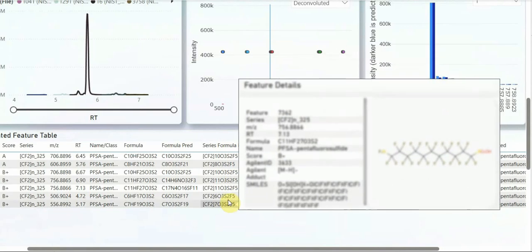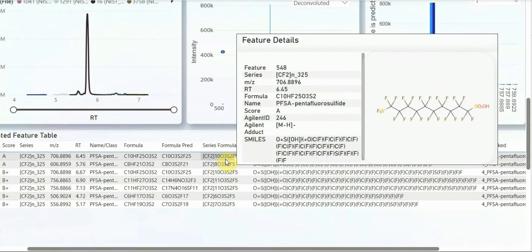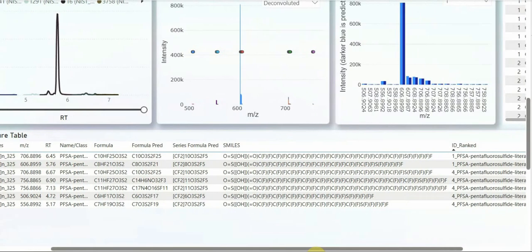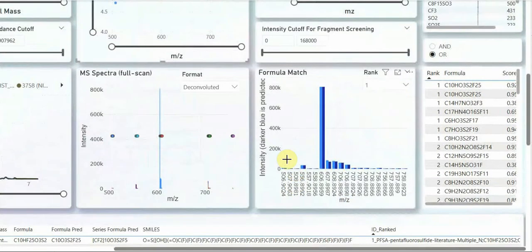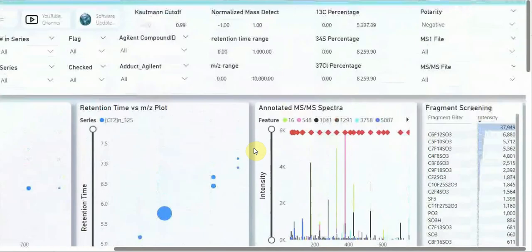And this approach is a 0% false positive formula prediction, especially when integrated with the Explorer workflow, because as you remember, the isotopic deconvolution done by Explorer across many samples that we integrate leads to much higher isotopic fidelity than if you were to use the raw Agilent files themselves in the FluoroMatch flow version.